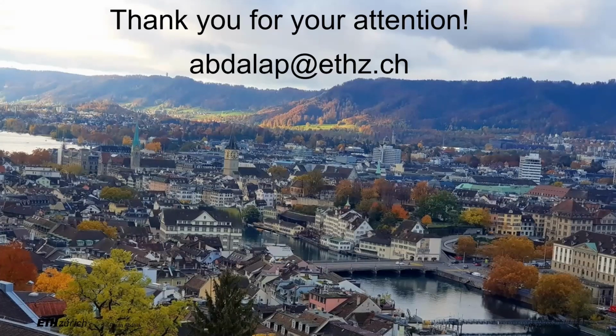Yes, thank you so much. And thank you, Paula, for the great presentation. I was just wondering about the reactor you were using, the reactor design. You showed the setup. Would you use the same reactor if you want to do studies on reactions requiring higher temperatures, more than 500, 600? I know sometimes the windows have to change, things like that.